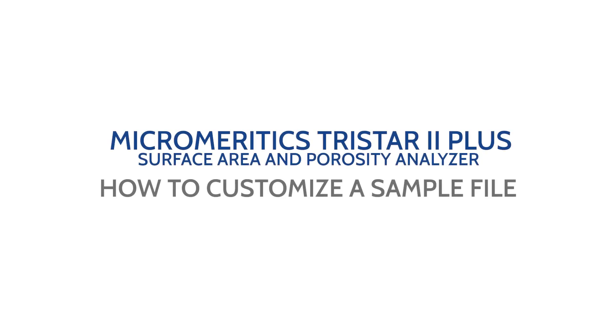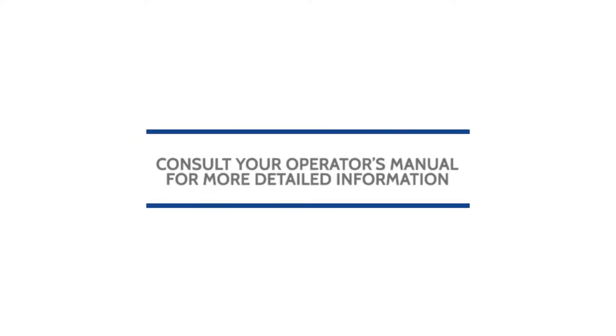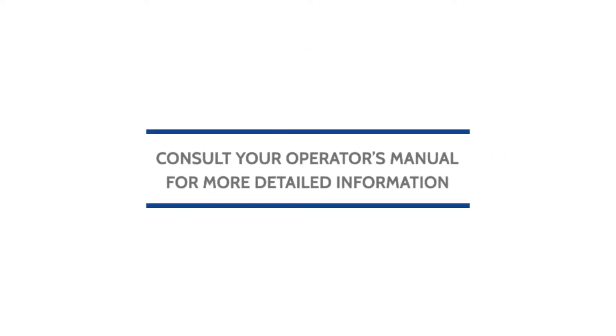This video will show you how to customize a sample file in the Micromeritics Tristar 2 Plus microactive software. Remember to always consult your operator's manual for more detailed information.